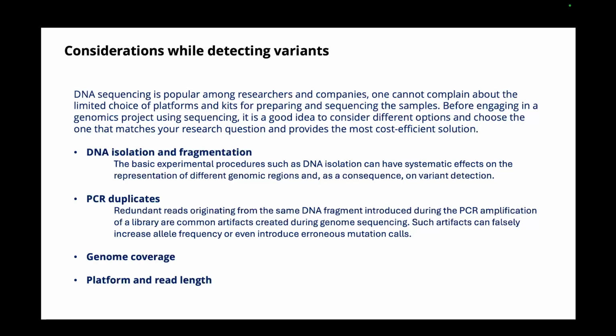Now, 150 base pair read length is not enough evidence to claim a repeat or a particularly bigger variation. So say, for example, you have a 1,000 base pair deletion in the genome. It's very hard to have evidence for the 1,000 base pair deletion with reads of 150 base pairs or 300 base pairs aligning against each other.